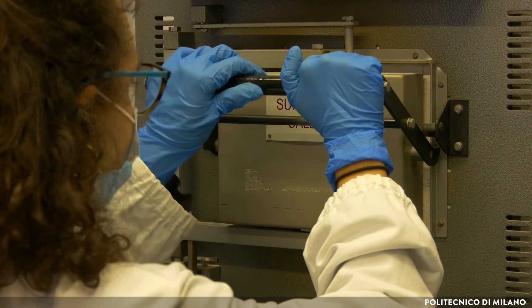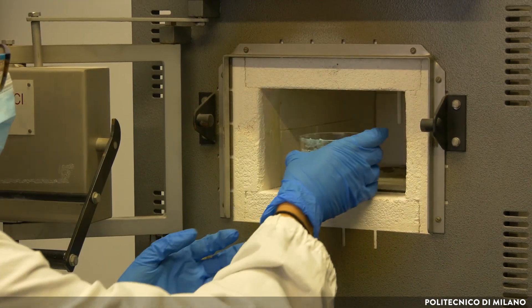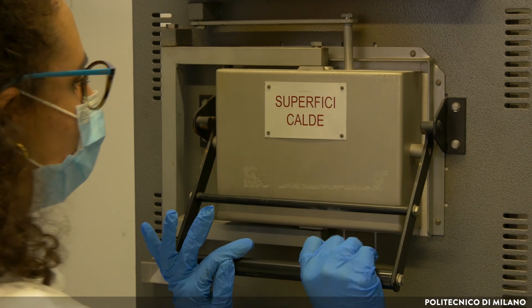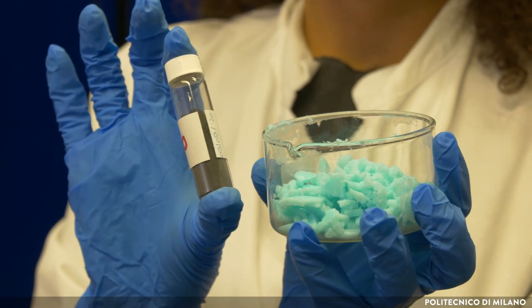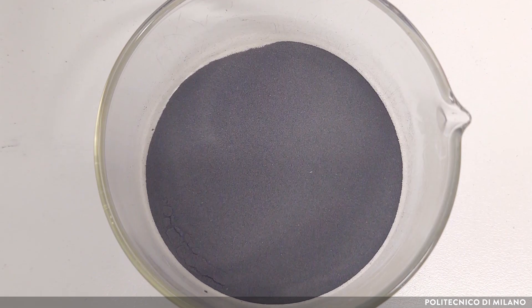Finally, calcination at high temperature, near 500 degrees Celsius, has been performed to obtain the final catalyst. As you can see, the wet solid precipitate is blue, while the calcined catalyst is dark.